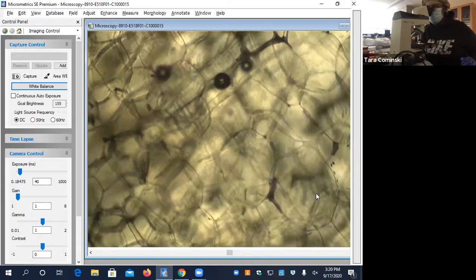Let you guys get this. All right, found some. Kind of got it. Like I said, it's going to kind of look like that. Let me go get my lab manual so I can show you guys the picture that's in there. Okay.